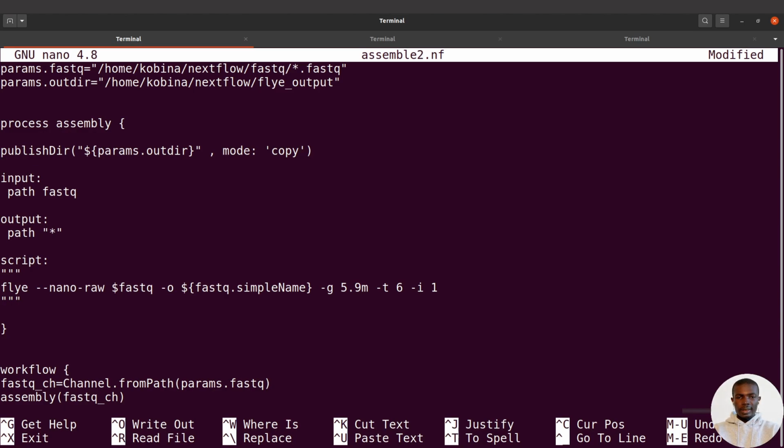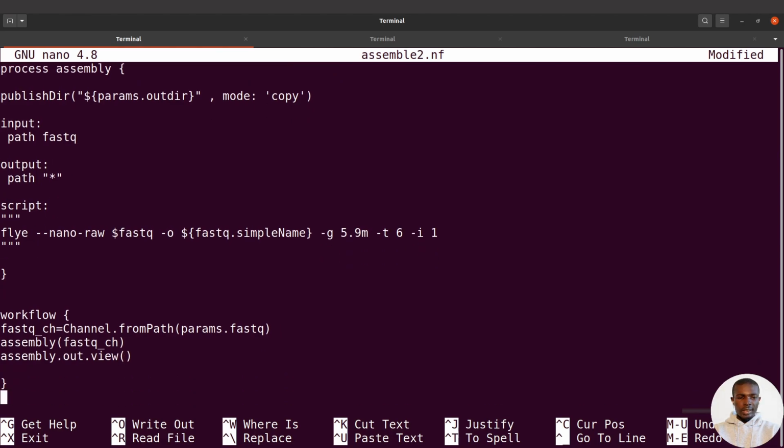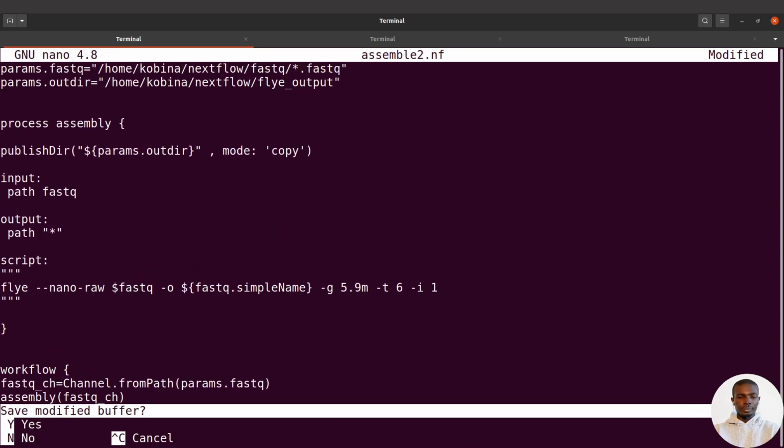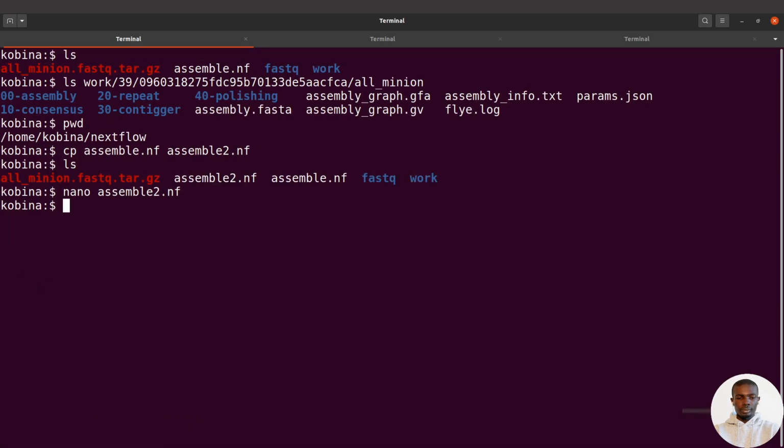All right, so that is it. We don't need to change anything again. That is all that we have to add. The rest, we will still maintain them as they are. So let's exit and then save changes. All right, so I'll do an ls again just to look at my stuff.